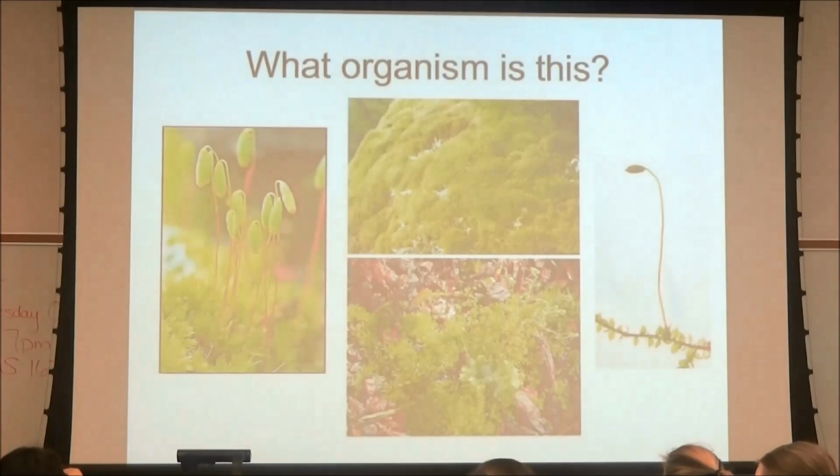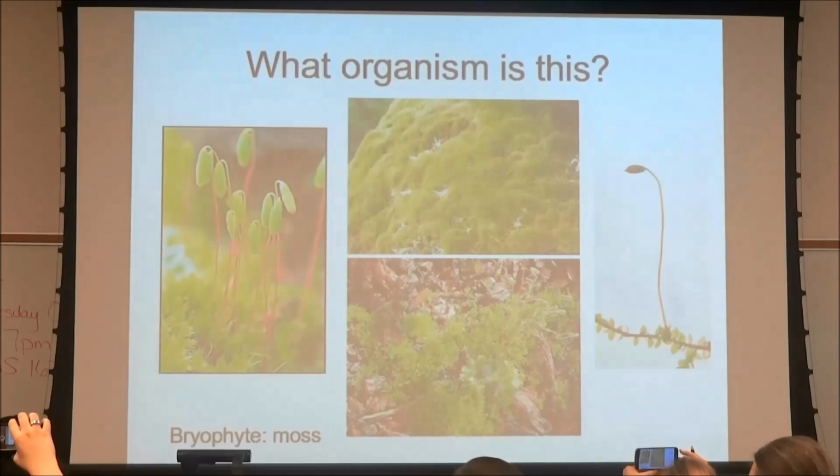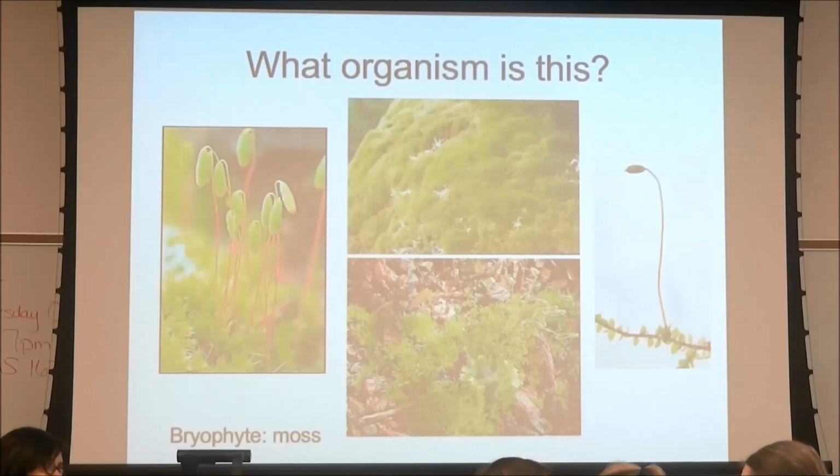Alright, what is this? Moss. Okay. There we go. Oops, sorry. This is the moss. And how did you guys know it was the moss? Okay. The lecture students are because of the capsule, right? It's got the capsule. Okay. One, it's small, right?